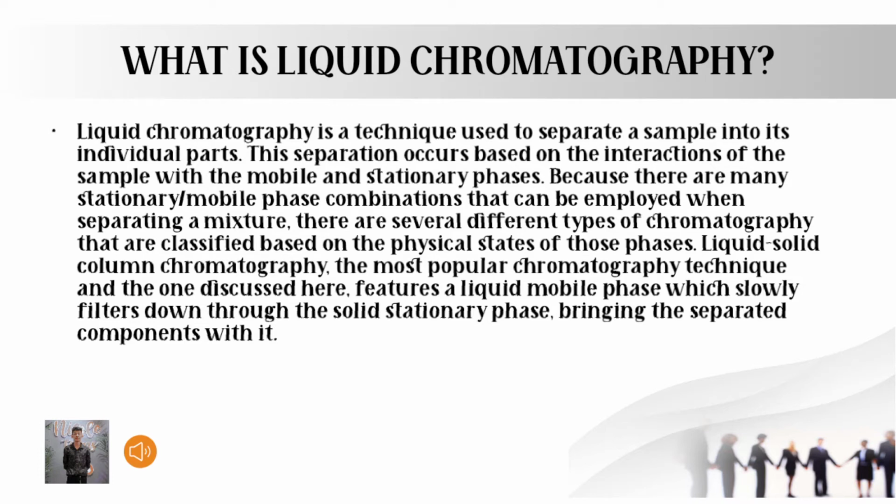Liquid-solid column chromatography is the most popular chromatography technique and the one discussed here. It features a liquid mobile phase which slowly filters down through the solid stationary phase, bringing the separated components with it.